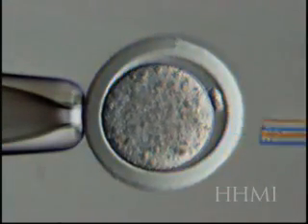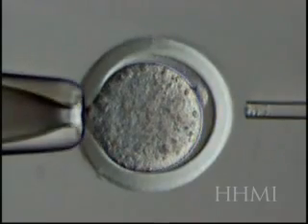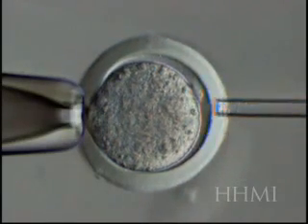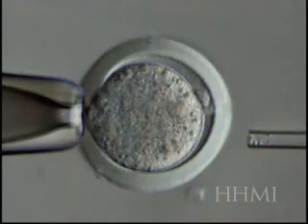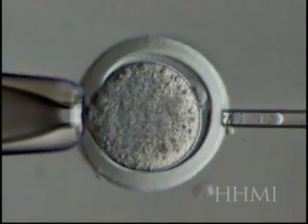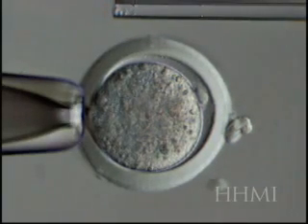You'll see now that this drilling pipette is going to drill a little hole into the membrane. This pipette isn't really sharp like a syringe. There you can see a bit of the hole. And now the pipette's going to go in and remove the nucleus — if you look carefully in the pipette, you'll see a line in the nucleus, which are all the chromosomes lined up. So that nucleus is going to be squirted out now because we don't need it anymore. And there we have an enucleated egg.